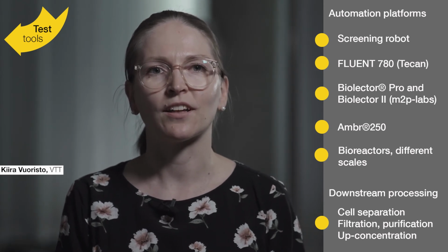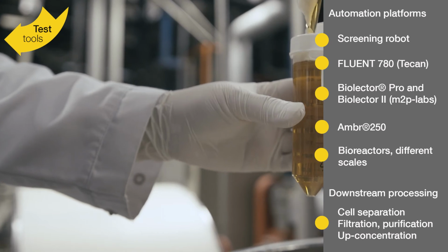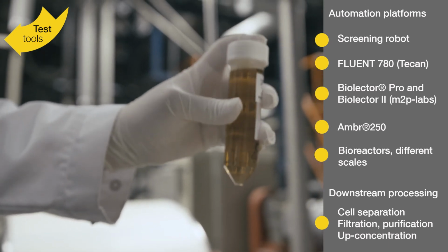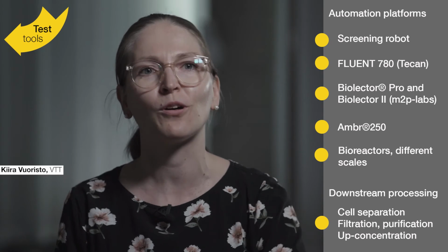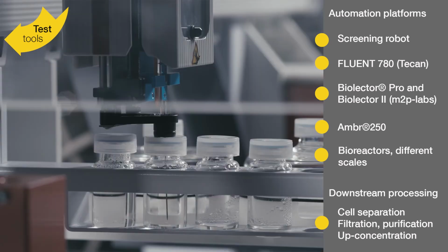And then we have different types of side streams we are working with, so pre-treatment steps before you can actually ferment your microbes. Then we think about other purification related costs, so that's often something that you don't really need to think about that much when you do experiments in small scale. But then in our pilot facility, these are the things that we really need to see that the workflow works well. And for that, at VTT, we have quite a unique platform to carry out all those different steps.